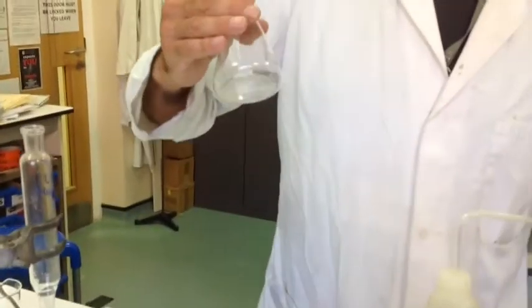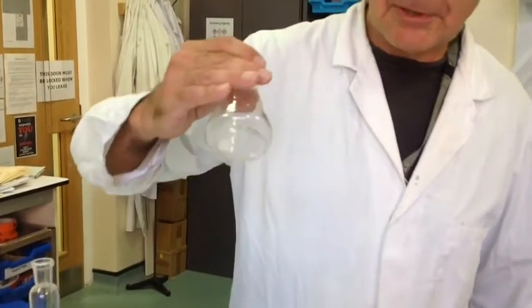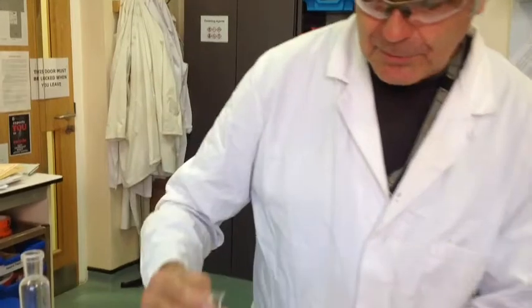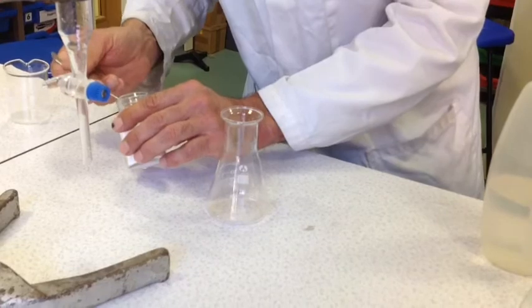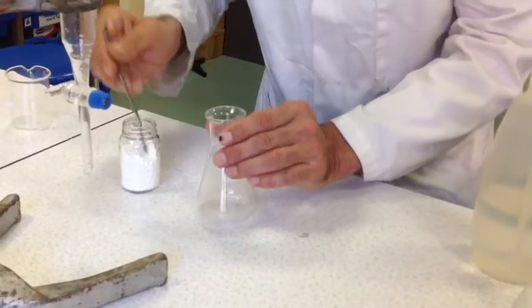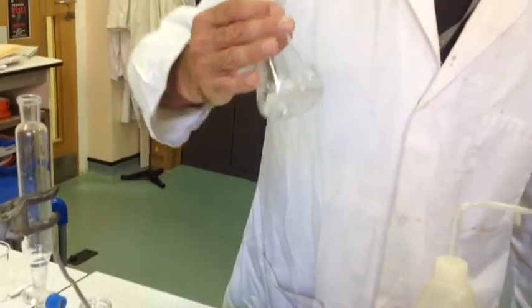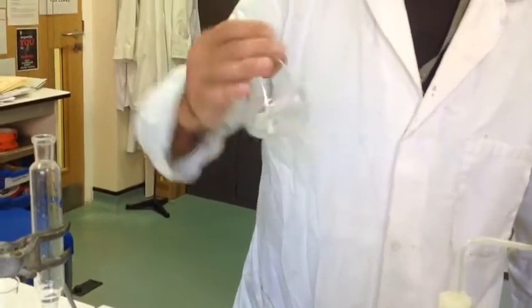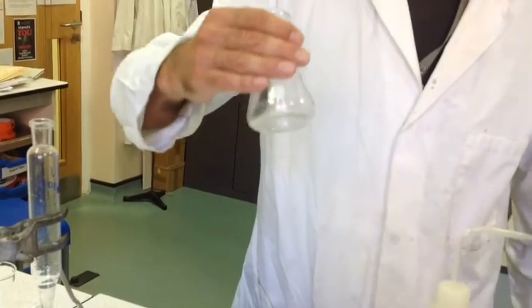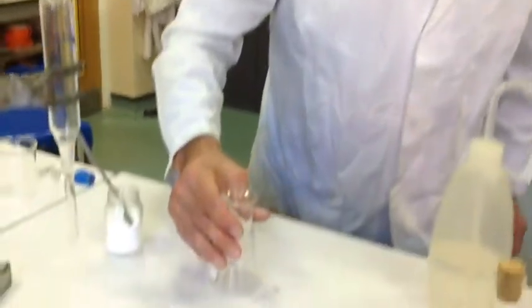Okay, I'm swirling the conical flask with the calcium chloride, and what we're looking for is the cyclohexene to become clear, or for the calcium chloride to start clumping. So I'm going to add a couple more lumps to that. And swirl again, and we continue this process until, as I say, the calcium chloride clumps or the cyclohexene becomes clear. And you can leave to stand for a short period.